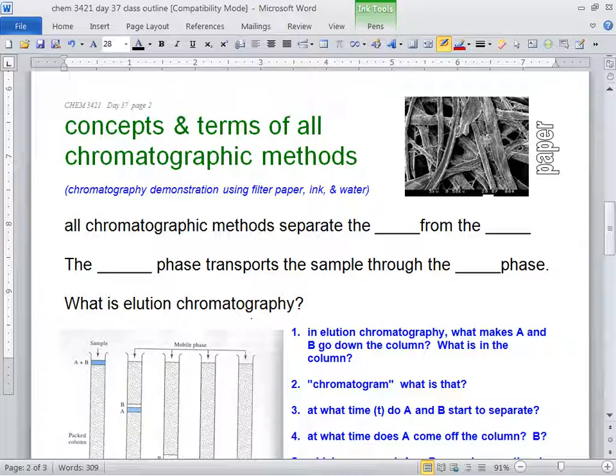Okay. Stationary phase. We're using paper. There's a hint up here, if you've seen these images before, how paper is going to do its trick to separate out all the little components in the different vis-a-vis markers. How's the paper going to do it? Where did my little marker go? Oh, I took it and pretended it was a vis-a-vis. What is this image? What is that? That's paper.